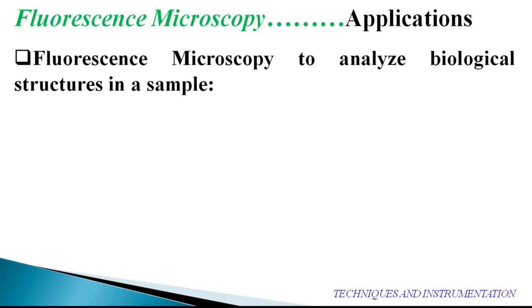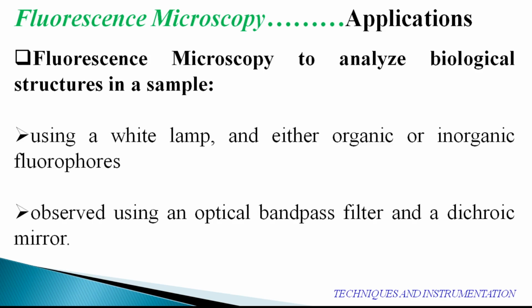And of course, such fluorophores or dyes excite photoemissive reactions, which are more often observed using optical band passes. I had told you about band passes in the last lecture, that is, band pass filters, and in fact a dichromatic mirror is also used for this purpose.